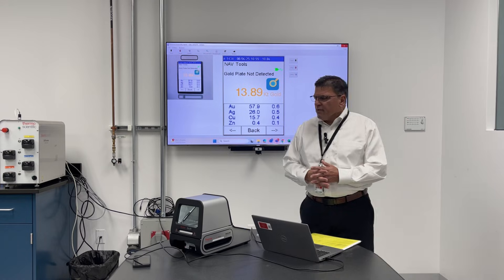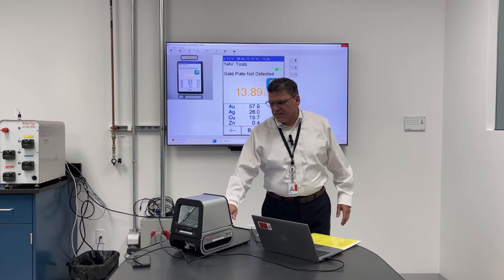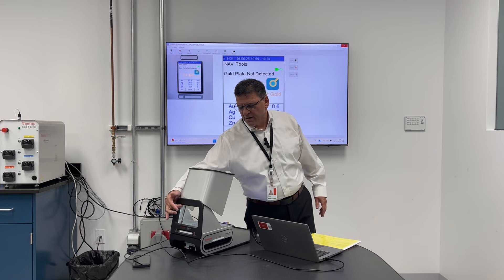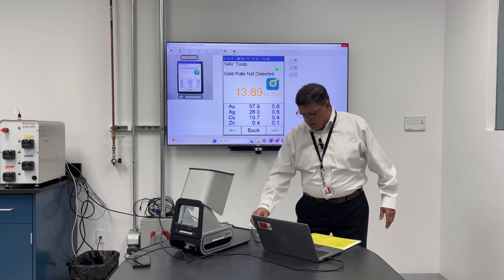Today I'm going to give you a brief demonstration. As you can see, it's a benchtop unit. You have the aesthetics of a two-sided closed beam system where the customer can see the glass on the other side of the desk, and the top has a very enclosed closed beam system.